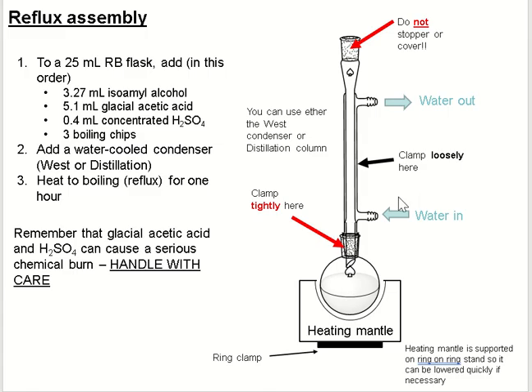For the reflux assembly, we use a heating mantle. Add 2.7 mL isoamyl alcohol (2.64 grams), excess glacial acetic acid, concentrated sulfuric acid, and some boiling chips. Add water-cooled condenser and heat to boiling temperature for at least 60 minutes, leaving the top open so that water can be removed. The heating mantle is supported on a ring clamp on a ring stand so it can be lowered quickly if necessary. Note that glacial acetic acid and sulfuric acid are very dangerous — handle with care.